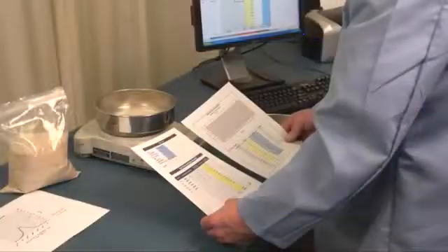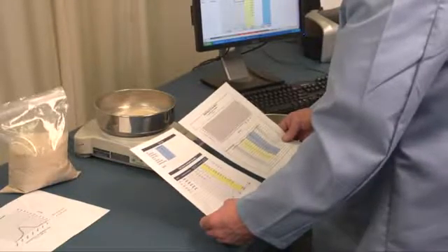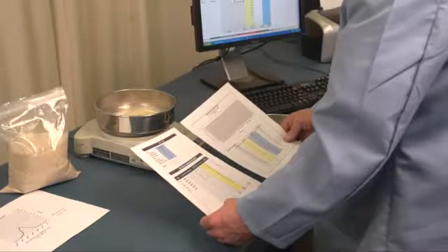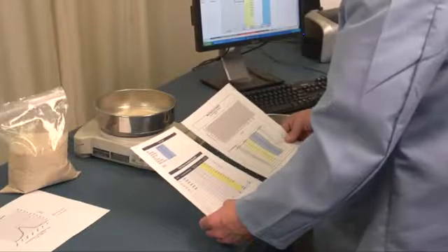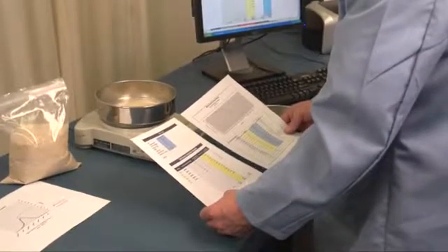With the test sieve data now collected, an analysis can be performed. To begin your analysis, compare the product specification requirements to your results. The recorded data, highlighted in yellow, should be compared to corresponding requirements of the product specification sheet, highlighted in blue, to determine whether or not the size distribution of the sample material is acceptable. This concludes the sieve testing process.